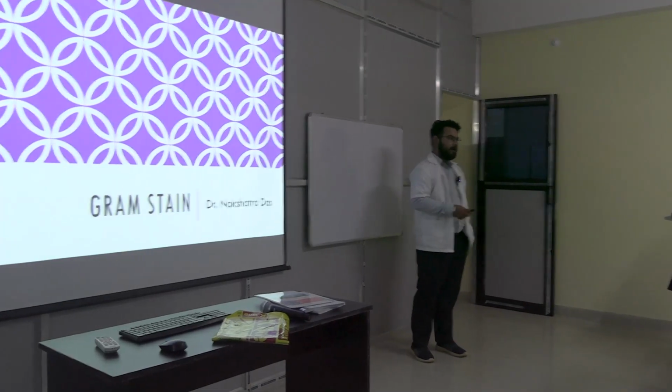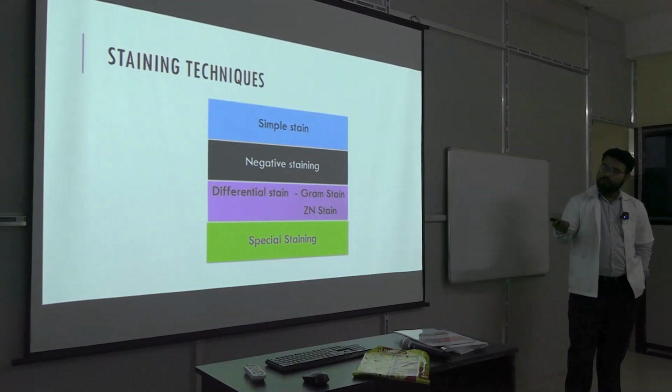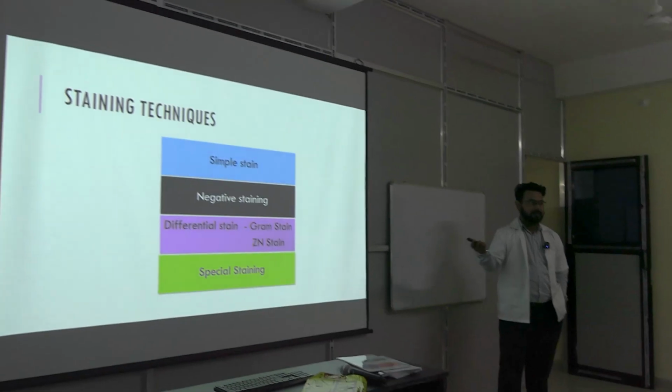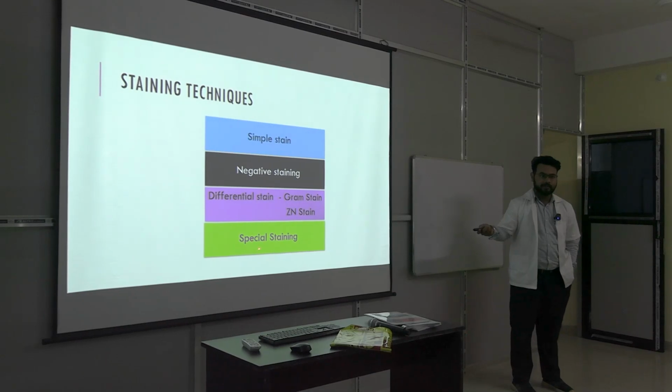Gram staining: how to do gram staining, what are the steps? But first of all, we'll recap a bit. What are the different types of staining techniques? Again, you can read and tell me. Come on. Simple staining, negative staining, differential staining, special staining.